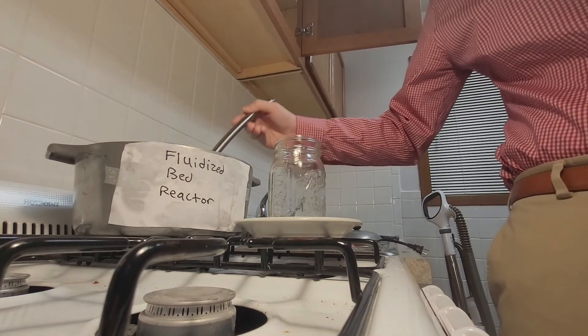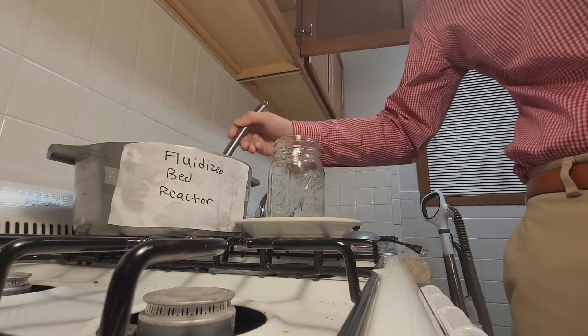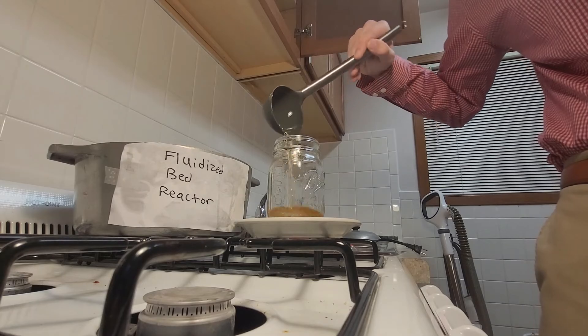It looks like our pyrolysis process is finished. The product is catalytically upgraded pyrolysis oil, an oil that can be either sold as a commodity chemical or even used to make 100% recycled plastic. It can also be burned as fuel.